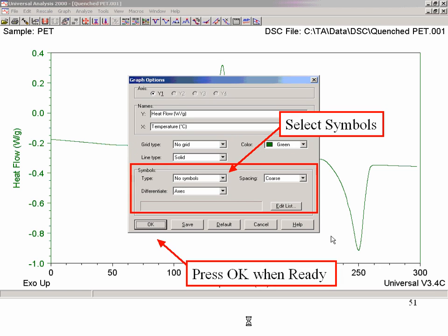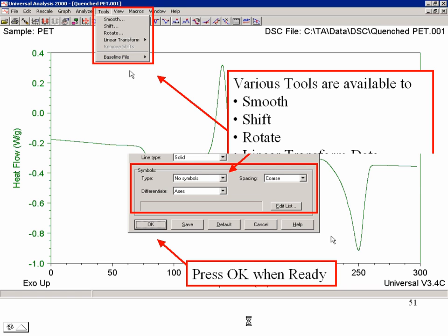Okay, you can also use symbols. People that do DMAs like symbols. So if you do want to use symbols, they're there for you. They're actually useful if you don't have access to color printers and copiers, and you need to differentiate multiple axes, multiple curves. You may need to resort to symbols. Okay, so get all that stuff the way you want it, press OK.